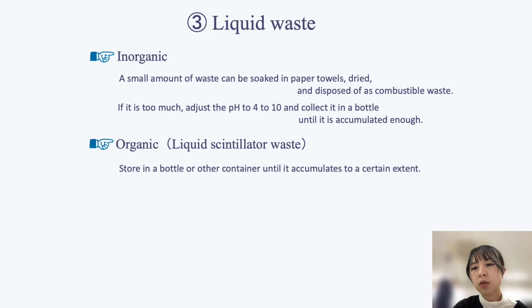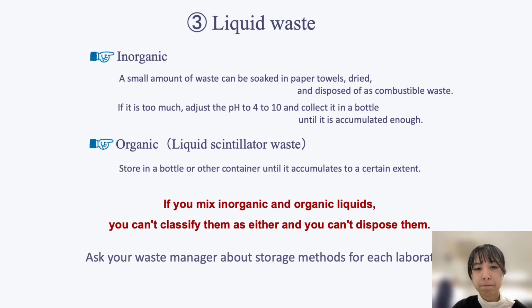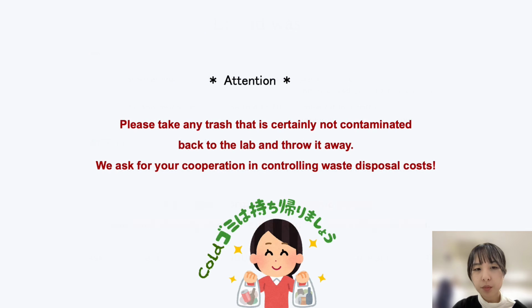There are two types of liquid waste: inorganic waste and organic waste. Please do not mix them, and ask your manager about storage methods for your laboratory. Please take any trash that is certainly not contaminated by radioisotopes back to the lab and throw it away.